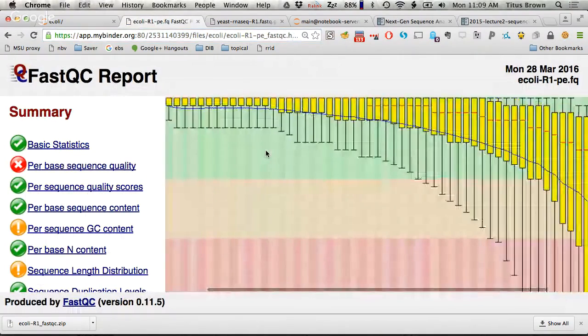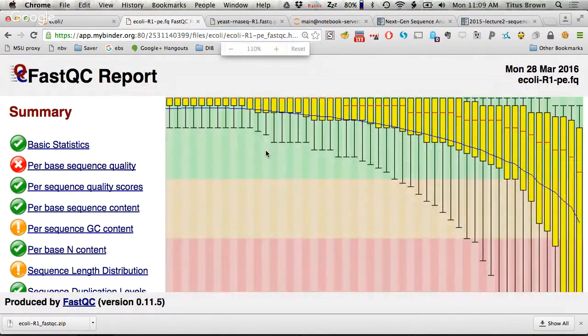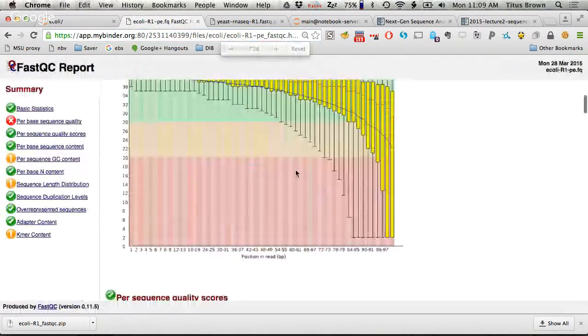And basically, the quality scores will not have changed much at all, this distribution, because you're really only trimming off things that were already down in this region of the quality scores. And that was very, very little of the sequence, right? 99% of the sequence was kept. So your trimming was very lenient, and you're not going to see much of a difference here. If you did see much of a difference, it would mean that there were a bunch of sequences that were quite bad all the way through, right? The whole sequence was bad, and so it's basically throwing away the whole sequence.